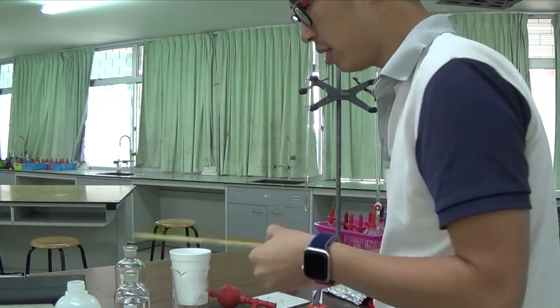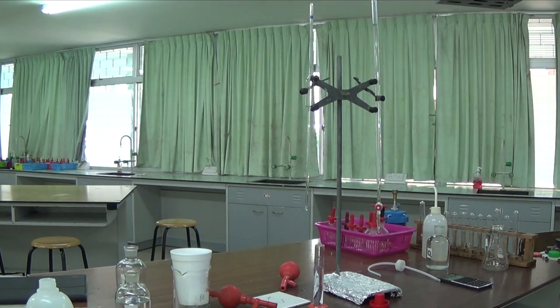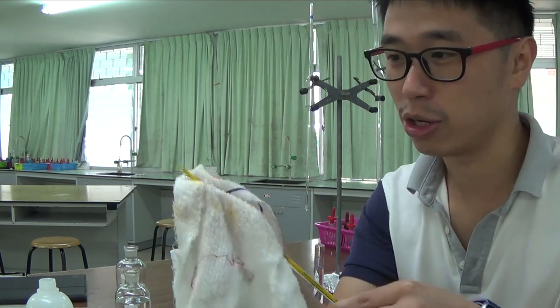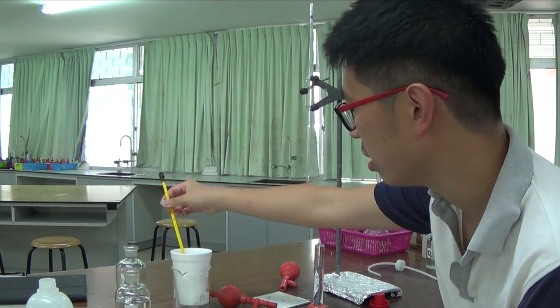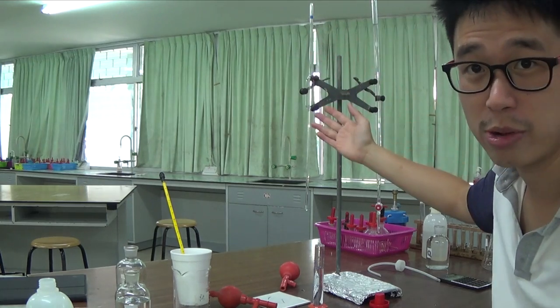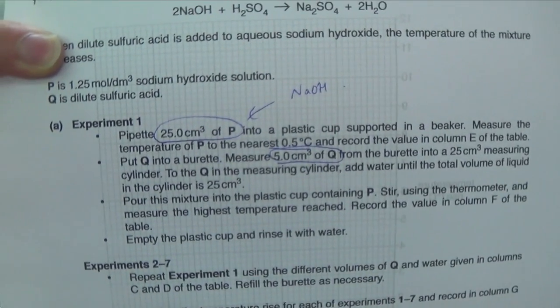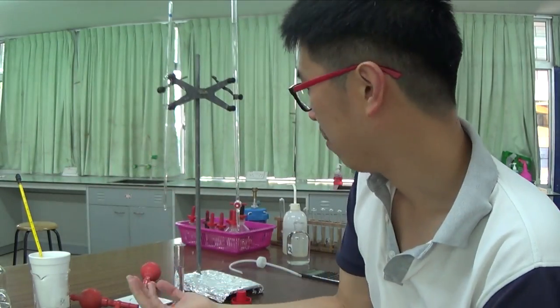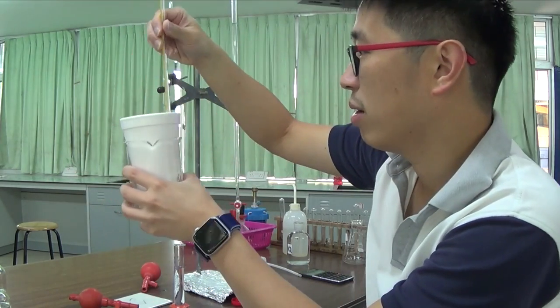So, I should have my thermometer. I should really clean it with tissue paper. I don't really have tissue paper with me, but in the real exam, you definitely have tissue paper, okay? I'm just using a dry towel here. So, I have to put into the plastic cup the solution from the burette just now. Oh, sorry, not from the burette, from the pipette, the 25.0 cm cube of P, into the plastic cup. I wait for a while because it was about 2 minutes ago when I washed it with distilled water and put it in the solution, right? So let's see what the temperature reading is.